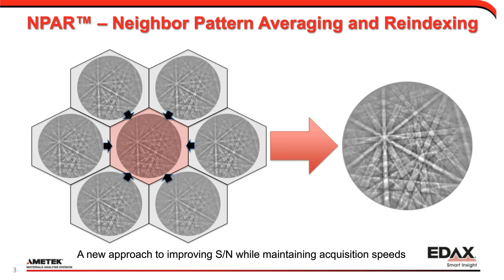So I have the pattern in the middle. It's an average of all 7 now. I'm starting back over and redoing from the Hough level all the way up, including the background.